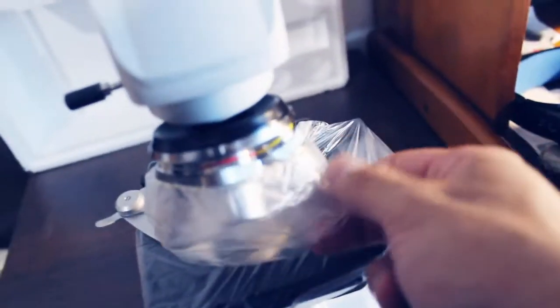As you can see, the most important parts of the microscope are covered in plastic to avoid damage during transport.